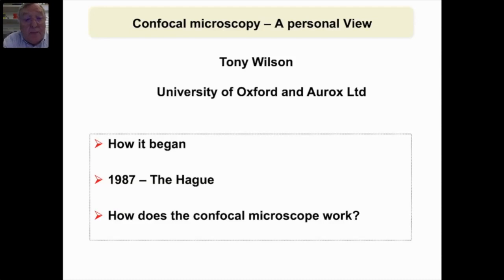Thank you. So what I want to try and do in the next half hour is to try and explain how we got interested in what was at that time called scanning optical microscopy, and also to indicate that what people found interesting right at the start is perhaps not quite what people find interesting now. And I first ran a conference in The Hague in 1987, and it's marginally interesting to have a look at what those talks were all about.